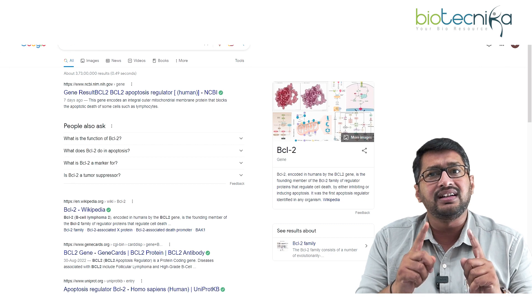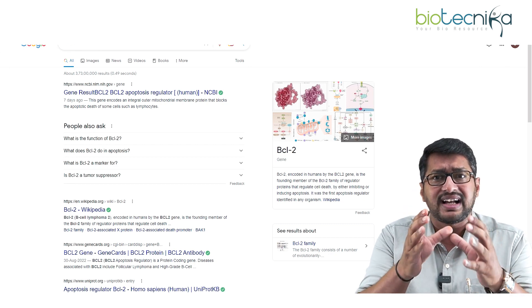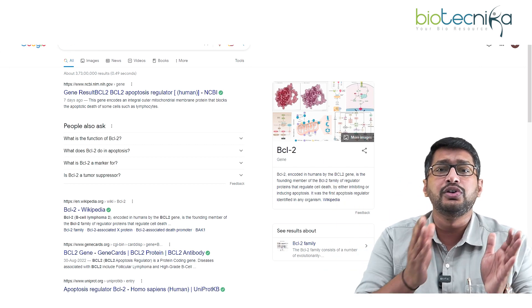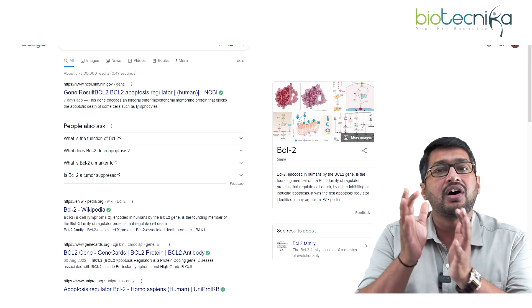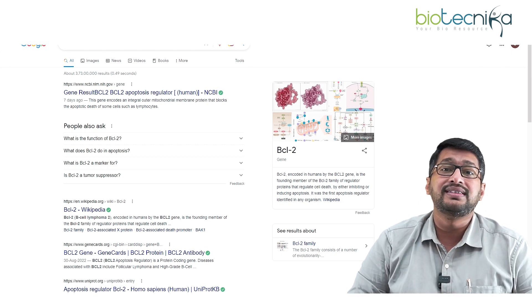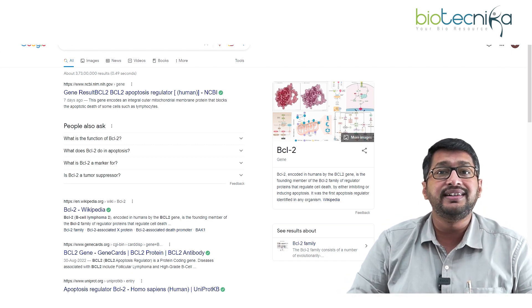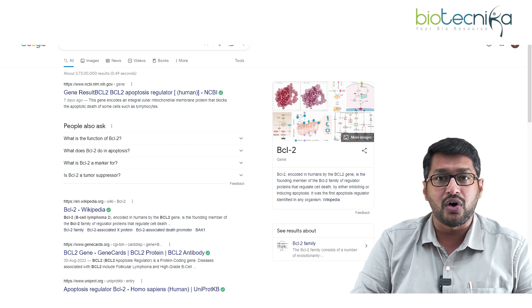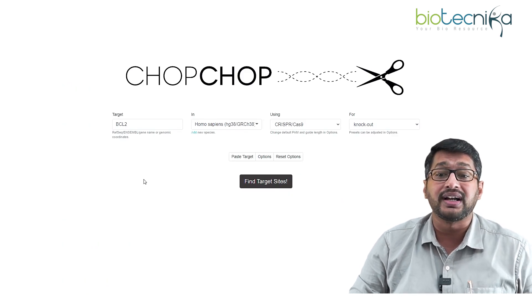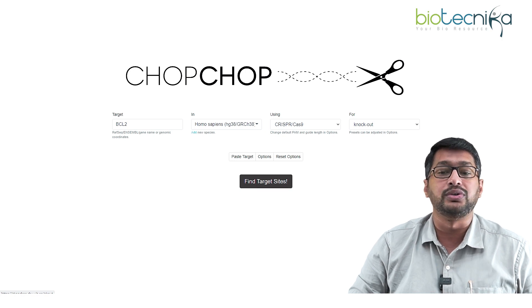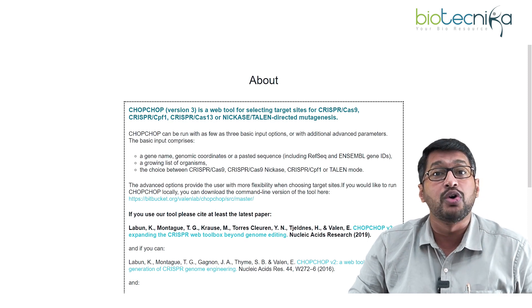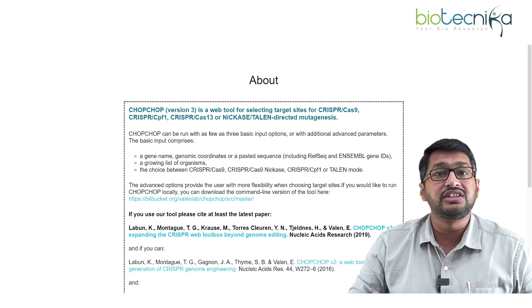Now that I know the background of BCL2, I can consider it as my gene of interest and decide to knock it out or use CRISPR activation or CRISPR interference technology. Once I've identified the gene of interest, I go to CHOP CHOP. If I click the 'About' tab, it explains the tool.